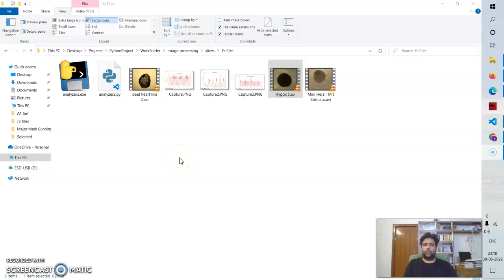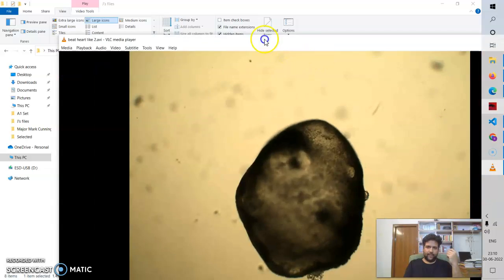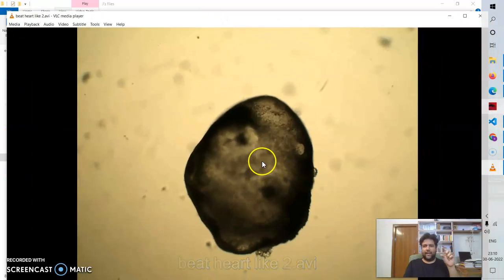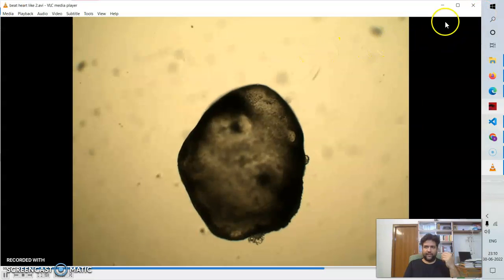Hi. So the last interesting project that I worked on was for a friend who works at a biotechnology laboratory in Germany. They deal with cardiac cells, cells with a heart-like tendency, who beat over a regular period of time, as you can see in this video. And they capture videos of these individual cells, and their task is to count the number of beats that they see in a video frame and calculate beats per minute from that and stuff like that.